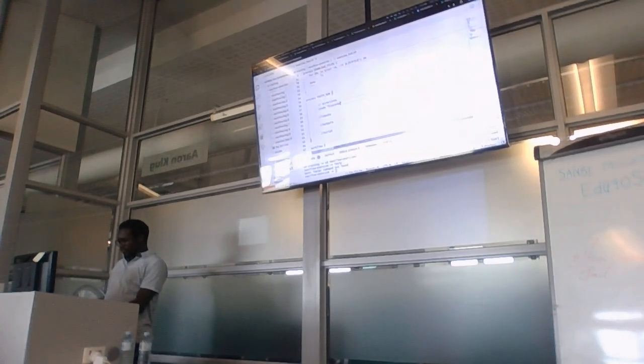Bioconda, with those two dots, and then you can just say fastp. And we can here state other directives such as CPUs, maybe 1 to 2 CPUs to use. I think that's enough for now.